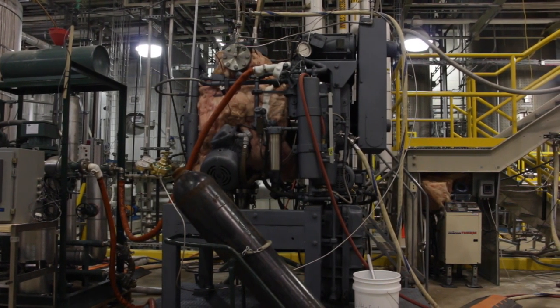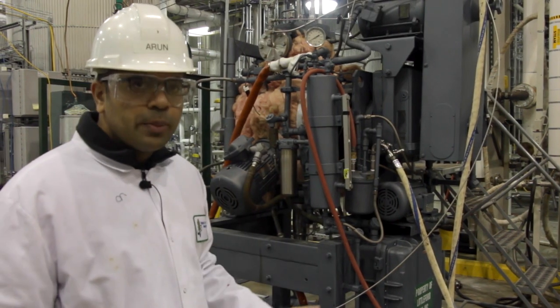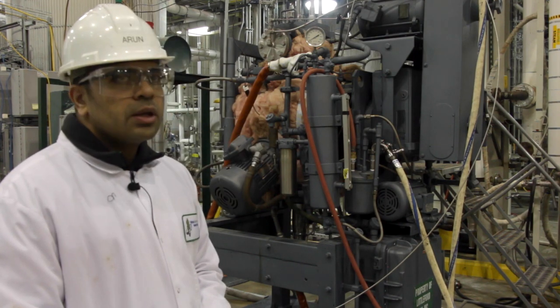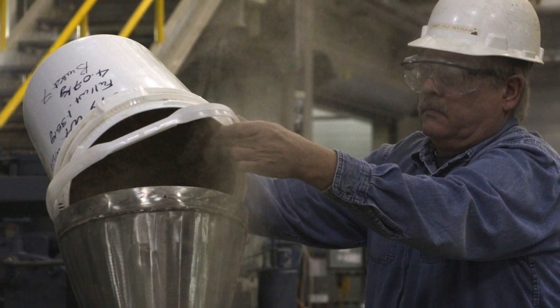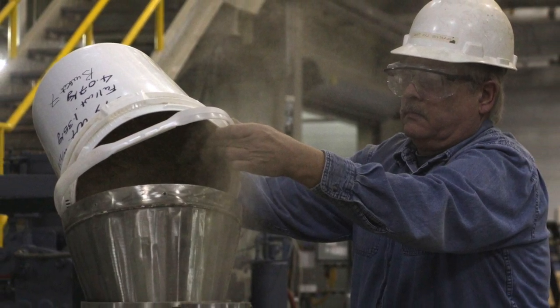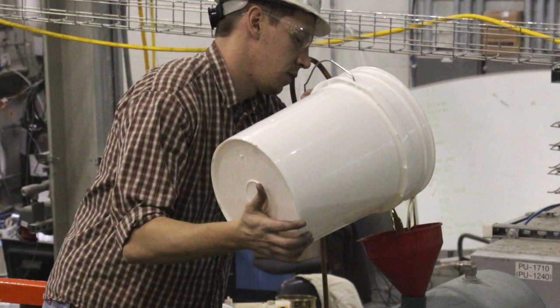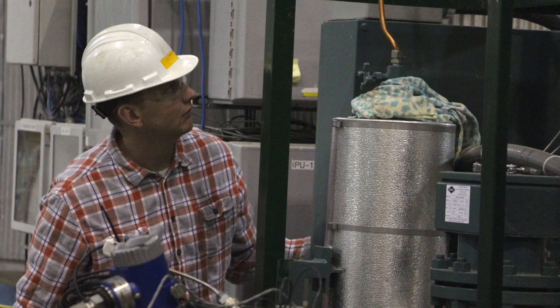What was done here was that corn stover, which is the biomass that we are interested in, was mixed with ammonia. We had about 15 kilos of stover mixed with about 75 kilos of ammonia, and the whole mixture was heated up to 110°C and kept at 110°C for 6 hours.